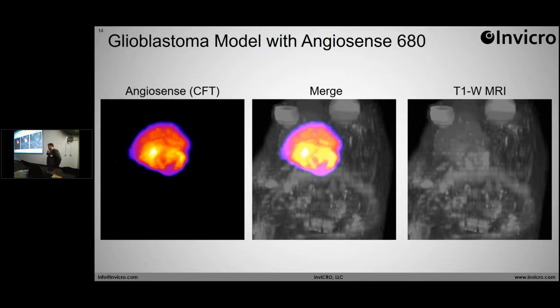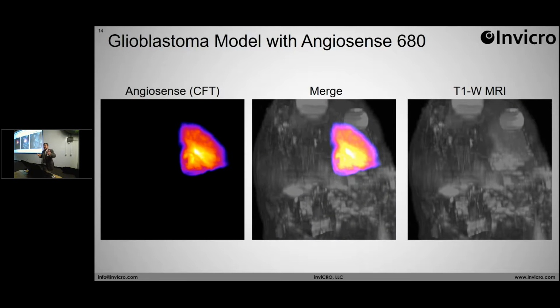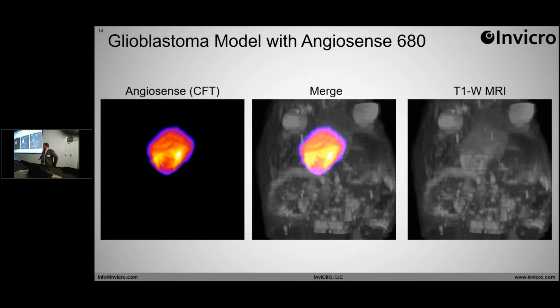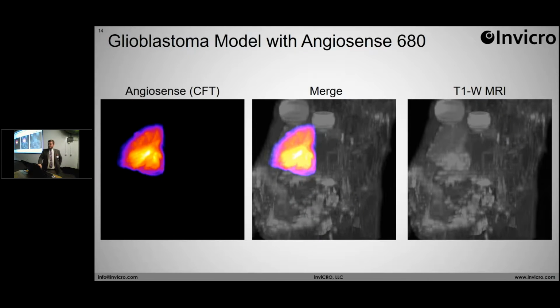And then we can start to render these things in 3D as well. What we're looking at in this case is the same subject overlain on contrast-enhanced MR. So we get complementary imaging information. You can see the blood, or the pool of the gadolinium, there as well.